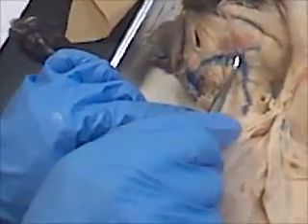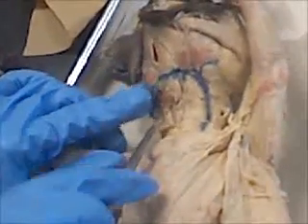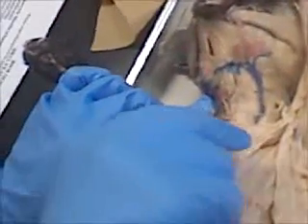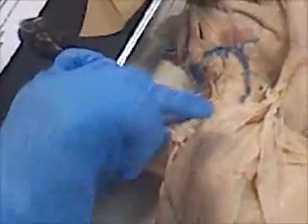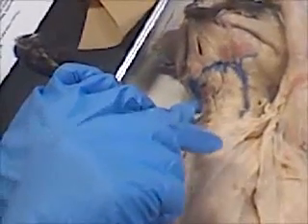This is the external jugular vein, and this is the internal jugular vein right here. Can you write that for me? It's not on the list, but we need to know it. Don't put it down there, but just in case I'm going to show y'all.